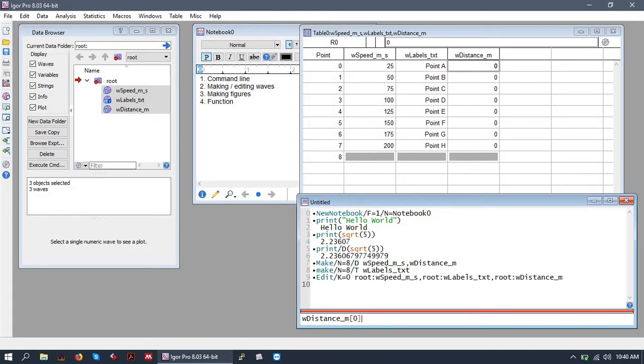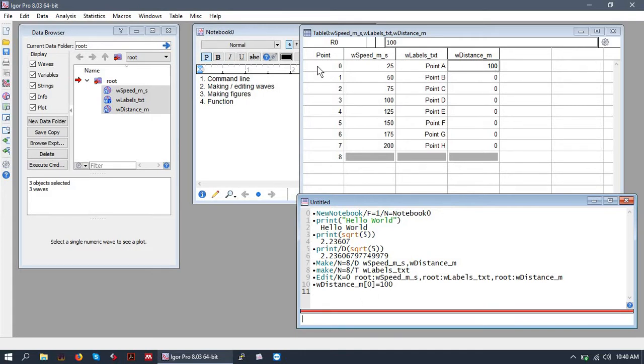Put the index of where you'd like the value to go inside the brackets and type equals the value. So you can see the table auto-updated to include our 100 at index zero of the wave.